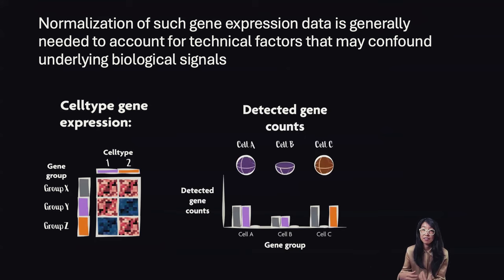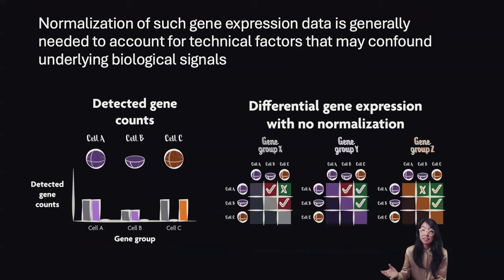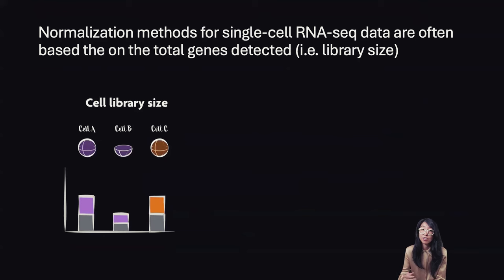Now consider we measure this gene expression in lots of cells, three of which are shown here: two cells, A and B, are cell type 1, and one cell, cell C, is cell type 2. However, for technical reasons related to sequencing depth, all the genes in cell B are detected at a lower level than in cell A and cell C. If we perform differential expression analysis or fold change analysis using such unnormalized gene expression, we may erroneously conclude that the group X genes are different between cell B and the other two cells, and that group Y genes are different between cell A and cell B, even though they're the same cell type.